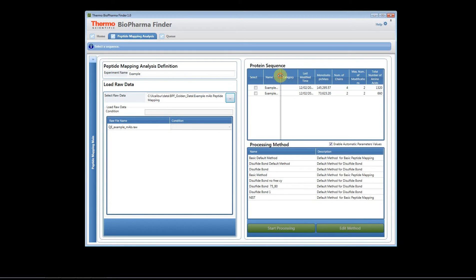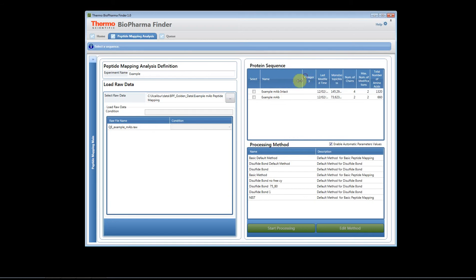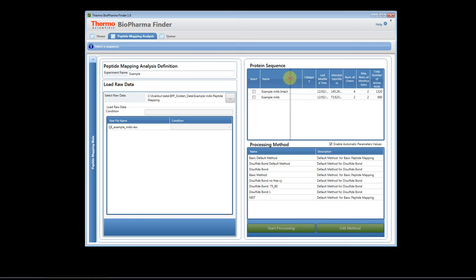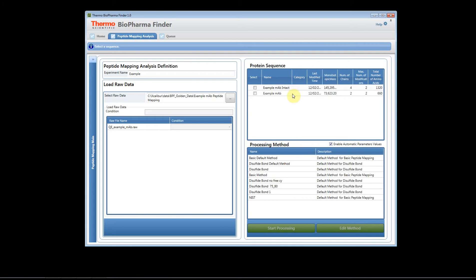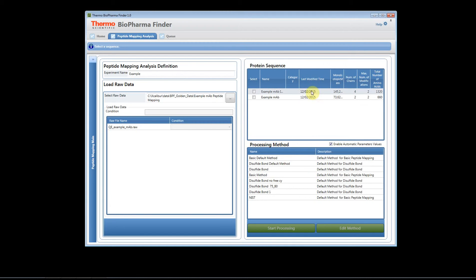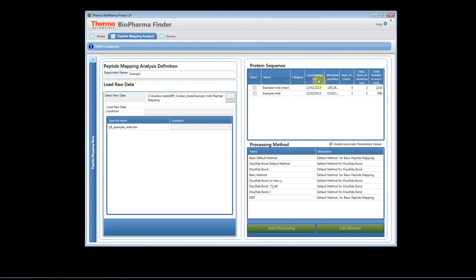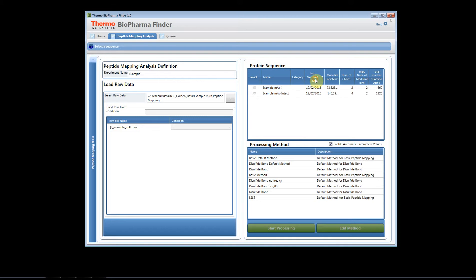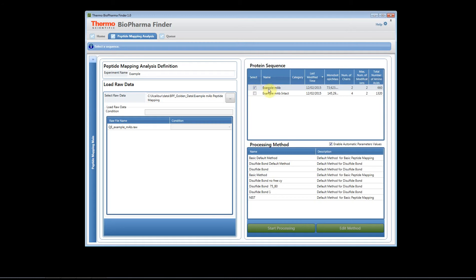We're going to select a protein sequence and this table here will update as you continue to add protein sequences to the software. You can scroll in so you can actually see different information. You can always sort by the different columns to find the most recent protein sequence that you've added. Now you just want to select the protein sequence that you're interested in.